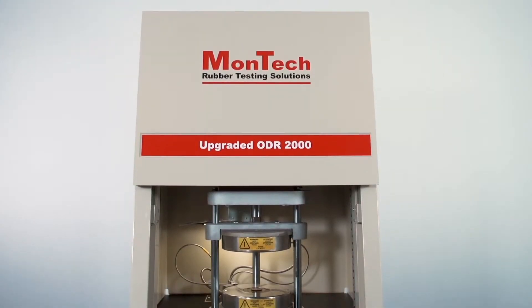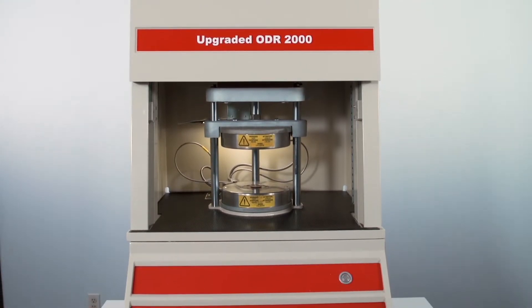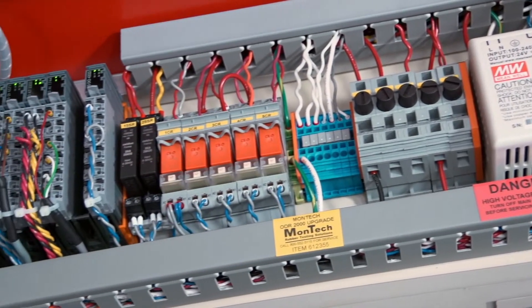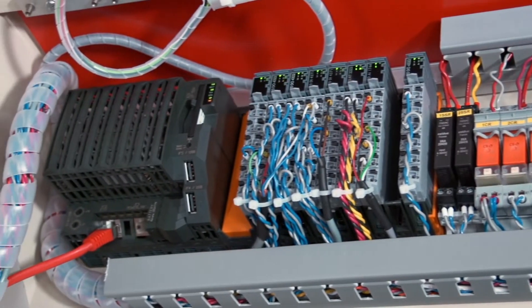Each machine is completely disassembled, and then the frame is glass bead blasted, cleaned, and repainted inside and out. Old circuit boards and ribbon cables are replaced with a new PLC to unlock new potential for testing and data analysis capabilities.